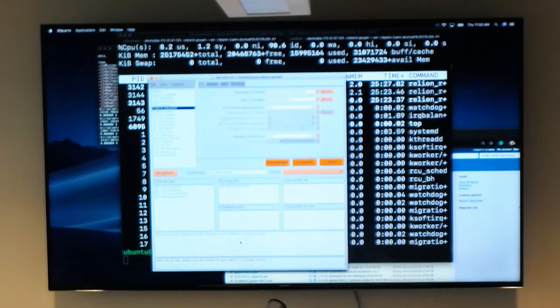I want to ask one question: the number of classes is one? Oh yeah, you have to change the number of classes. If you select one, you have one class; if you select two, you have two; if you select 50, you have 50. It's based on how many different types of particle you think you have in the system. In this case, you might only have 3 or so views. If you only have 3 views and I specify 1,000, those 3 views will be represented multiple times.